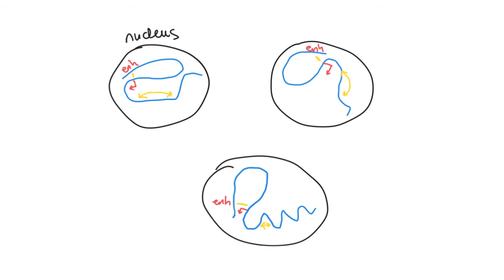So this is one way. If we had a way to figure out the three-dimensional conformation of chromosomes inside the nucleus, we could look for associations where more frequently than by chance, so these indicate sort of random interactions, sometimes they're far apart, sometimes they're nearby. That's what we would expect by chance if the chromosome was randomly folded inside the nucleus. But if we looked at different parts of the chromosome, we would see that there's an increase in the probability that we'd find those two regions of the chromosome near each other.